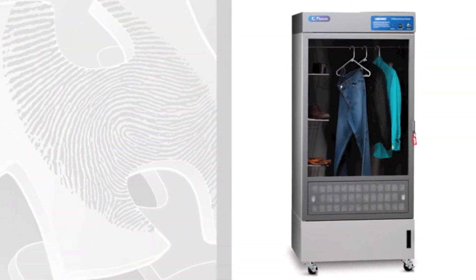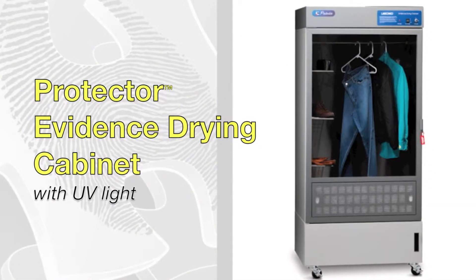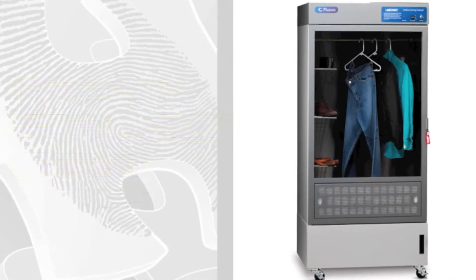There are two styles of Protector Evidence Drying Cabinets: a UV light model and a wash down model.